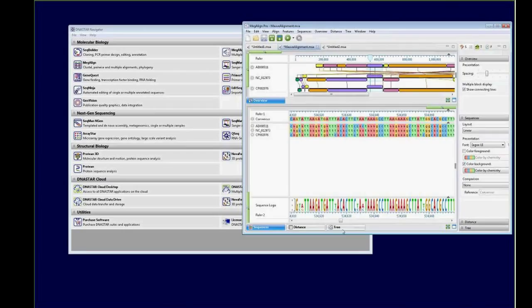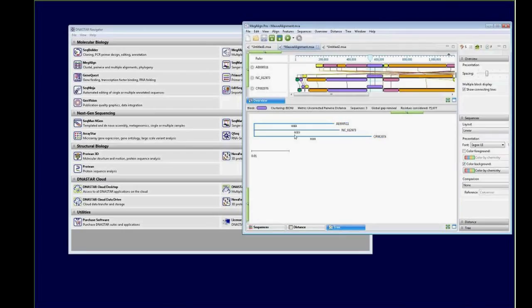Oh, sure. So those are calculated distances between the sequences. That's based on the sequence similarity. Technically they're branch lengths, but they represent the distances between the sequences, or the similarity between the different sequences in the tree.